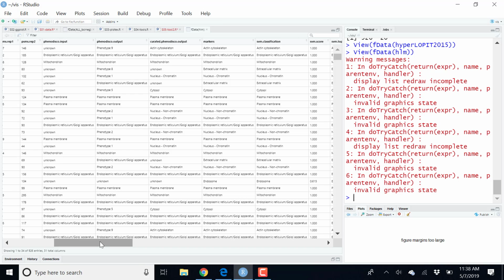The function, the code is exactly the same. We need to calculate distances and hierarchical clustering. But very often, when we do this, we get these trees that don't mean anything. I mean, they're just too big, too many features. So before doing this, we're going to transform and process our data.